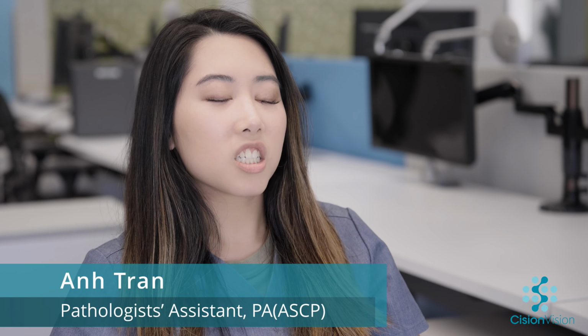There's no need to blindly submit tissue, which is a problem that snowballs down the line, putting more pressure on histotechs and pathologists, especially if you're having to blindly submit multiple times. This cuts down on delaying turnaround times, cutting down extra labor, and minimizing the number of cassettes that have to be wasted.